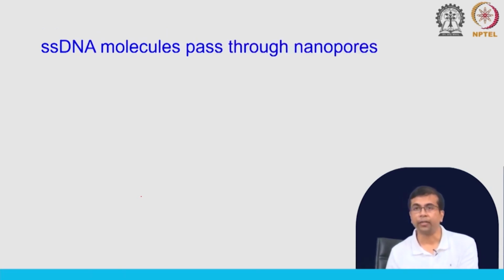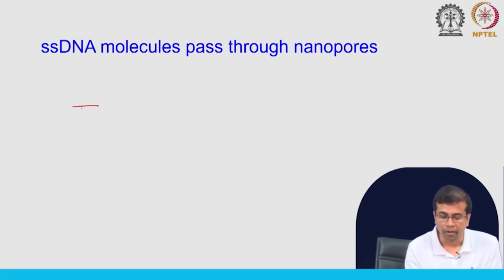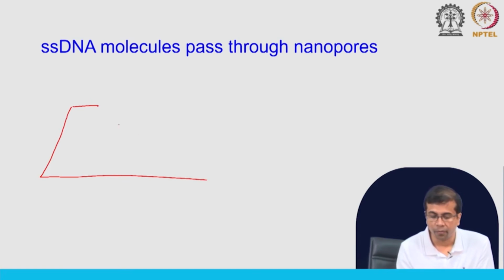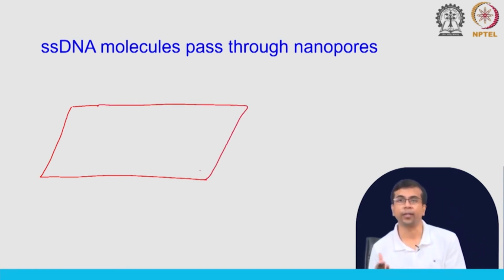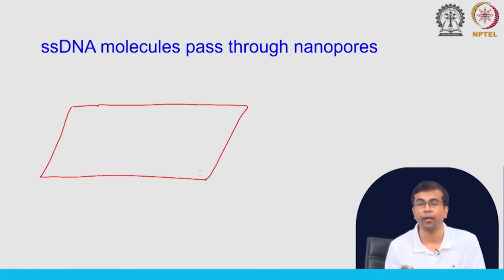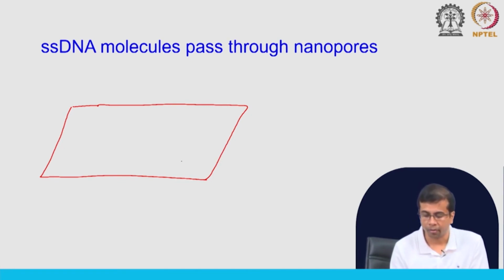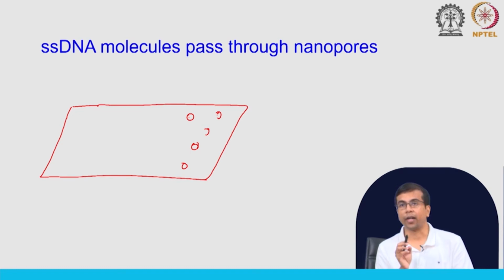Okay. So, what happens here? It is something like this. So, you have a nanopore like structure. You can imagine a flow cell. So, the sequencing happens inside a flow cell. You need something like this, either the SMRT cell, flow cell we have seen, or picotiter plates. So, here you have a flow cell where the sequencing happens, and on this flow cell you have millions of these very small pores, and these are called nanopores.